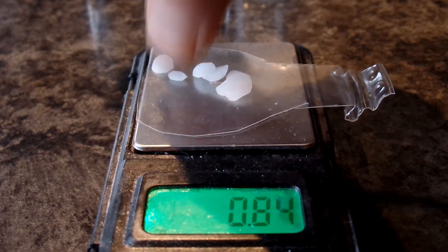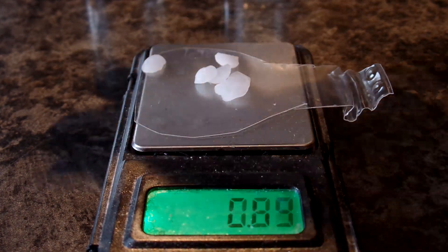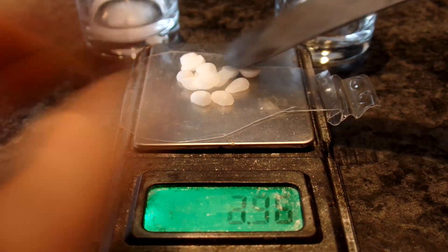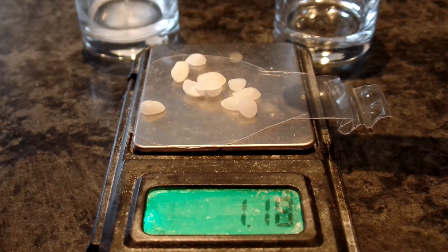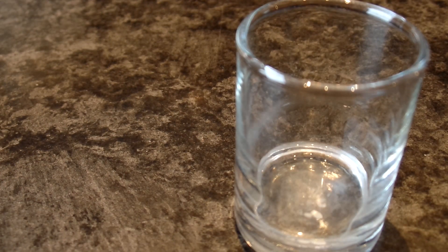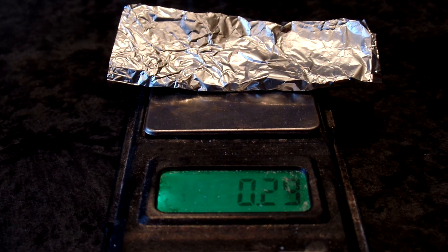For sodium hydroxide it is 0.8 grams and for potassium hydroxide 1.12 grams. The aluminum needed is 20 millimoles, which is about 0.54 grams.